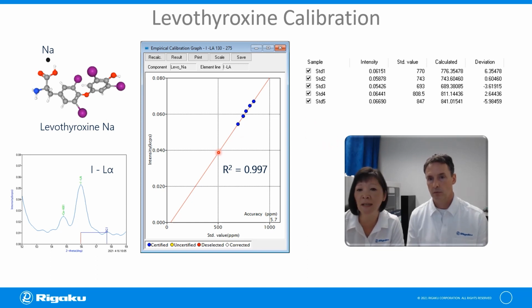And once you've created it, you don't have to recalibrate. We just maintain the method and then analyze the unknown afterwards again. And you can also do check samples or drift the method to maintain it. But the key here is you don't have to redo the calibration every day.